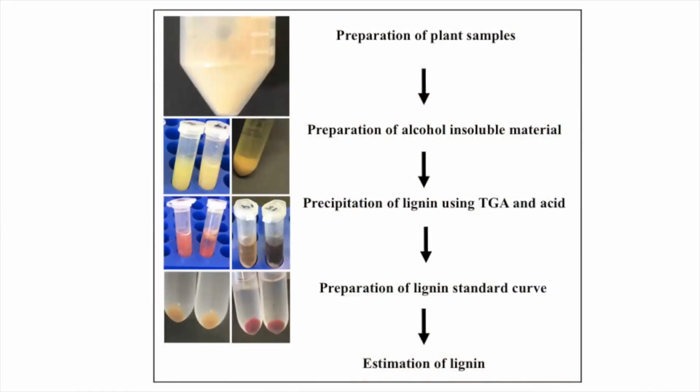This method is based on the principle that lignin binds to thioglycolic acid through thioether bonds. Further, we divided this protocol into 5 phases. In the first phase, we prepare the plant material.